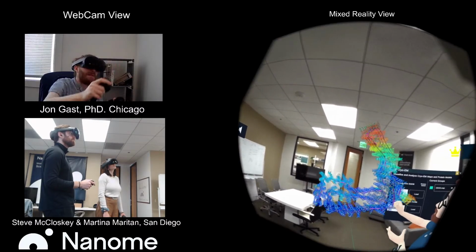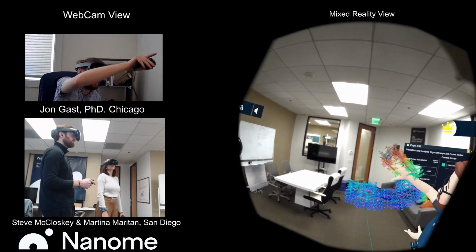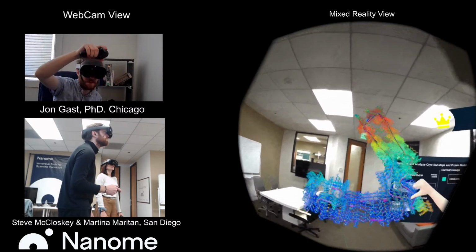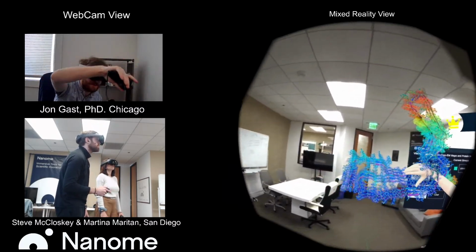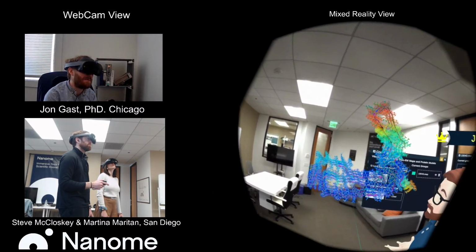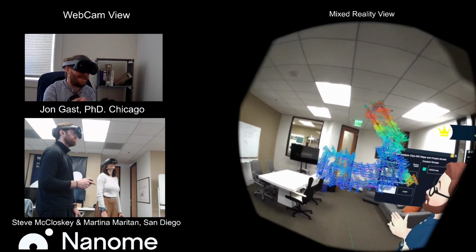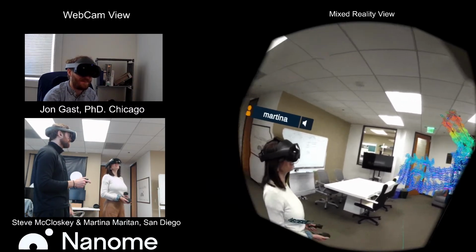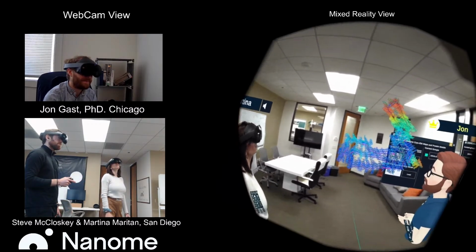And it's just very clear, like we have a flexible region here where it comes down to just two parallel sets. And then once we have three, we're getting very, very high levels of stability. And just like Martina said, this thing isn't going anywhere. It's going to stack like this, and these things are incredibly stable.